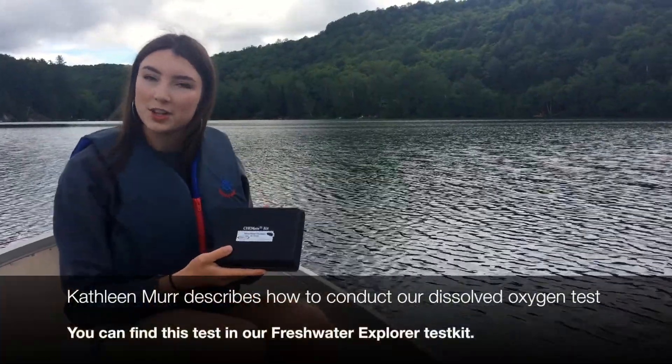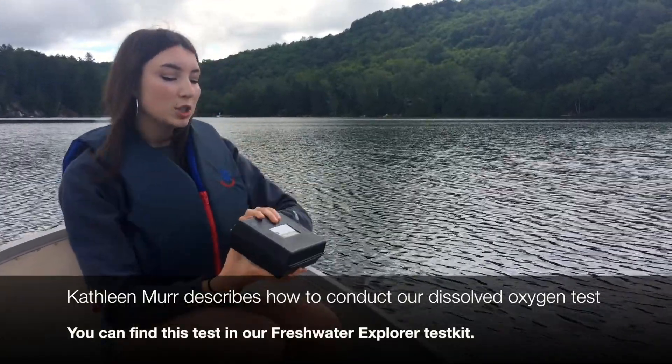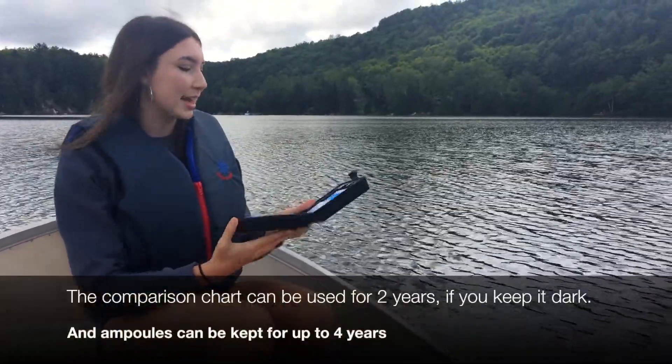Our next test is the dissolved oxygen test, and you'll notice that this test comes in a black box, and that's to protect the kit from sunlight. So when we're not using it, we like to keep the case closed, just so this comparison device doesn't get exposed to sunlight.